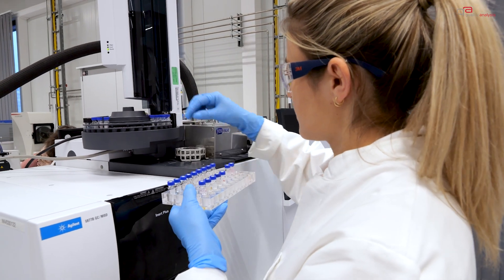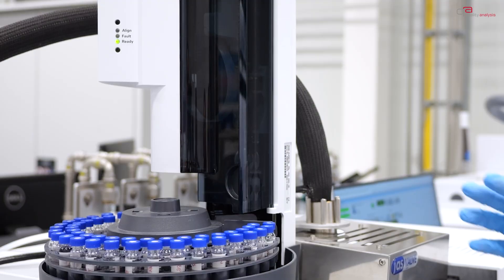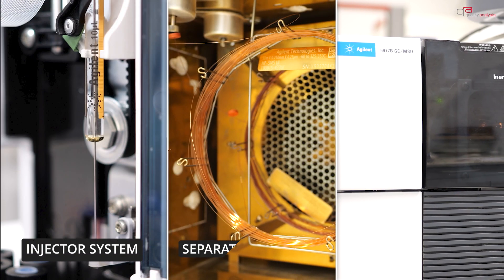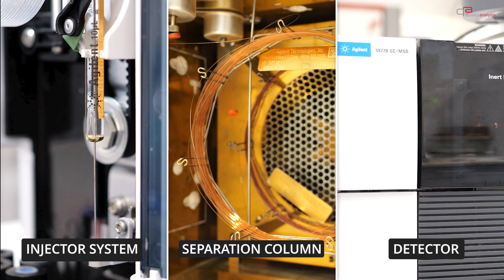A gas chromatograph consists of three main components that perform different functions during the analysis: the injector system, the separation column, and the detector.